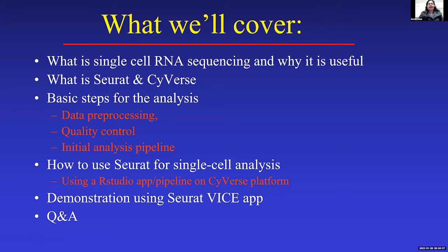As I mentioned, single cell is a high dimensional data set where we can explore the data depending on the questions we are asking, but some preliminary analysis would be common irrespective of the question that you will be asking. The common steps that I will be covering today would be data pre-processing, how to get started with your data once you have the data, how to do quality check on your own, and how to get ready with the interpretation of data on your own using this app.